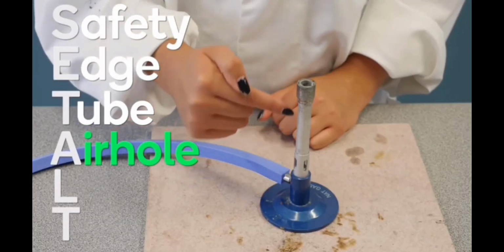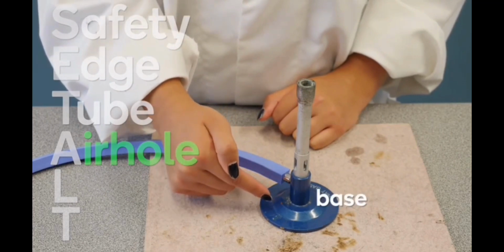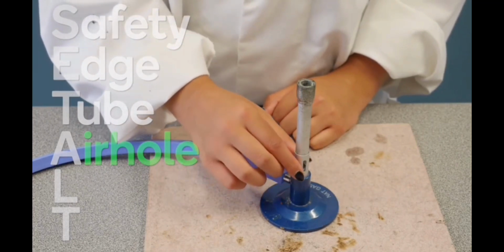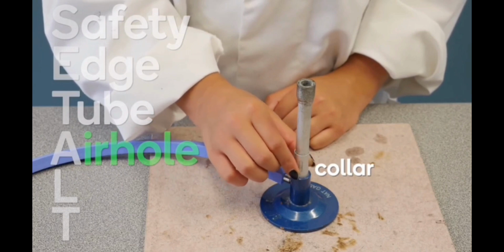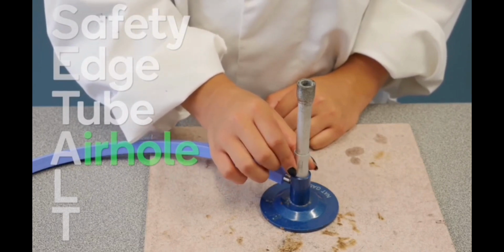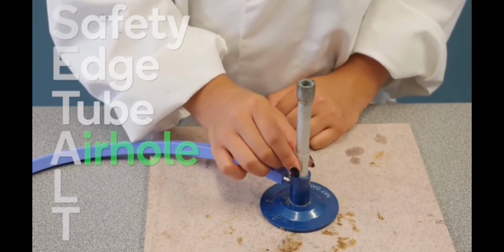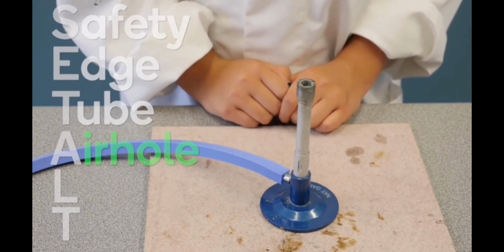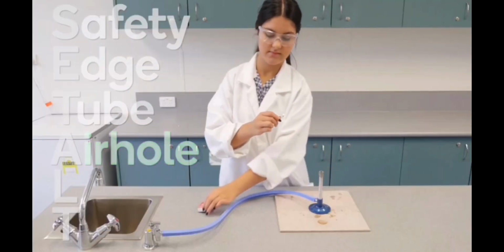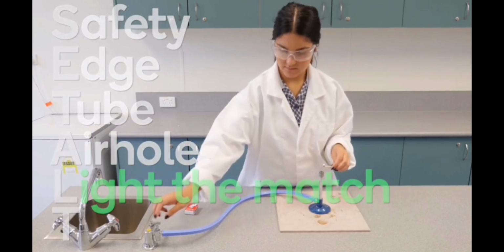A is for air hole. The air hole is located at the bottom of the barrel, near the base. It can be opened or closed by turning a metal ring called the collar. This controls the amount of air and oxygen that mixes with the gas. The more oxygen, the hotter the flame. Always make sure that the air hole is closed before lighting the burner. Okay, you're ready to light the match and hold it above the barrel.